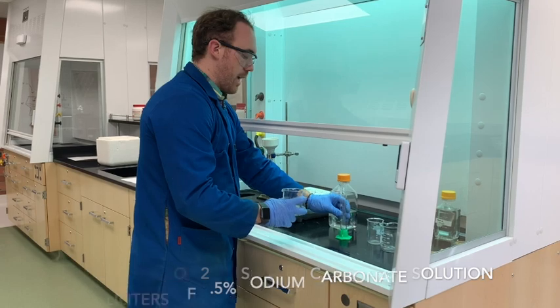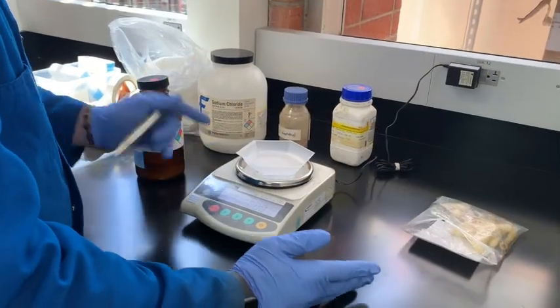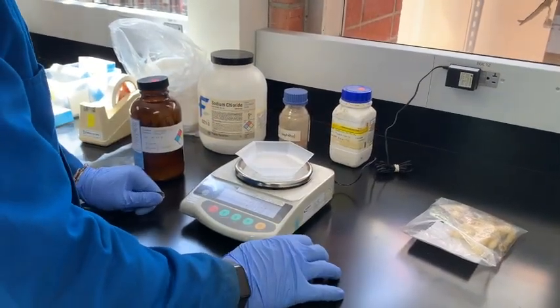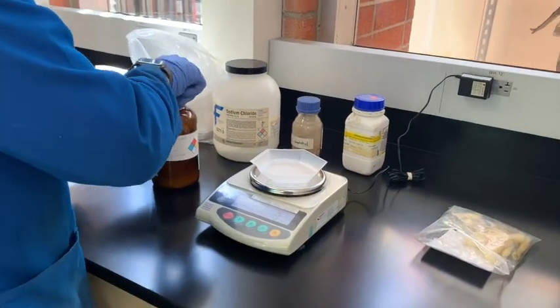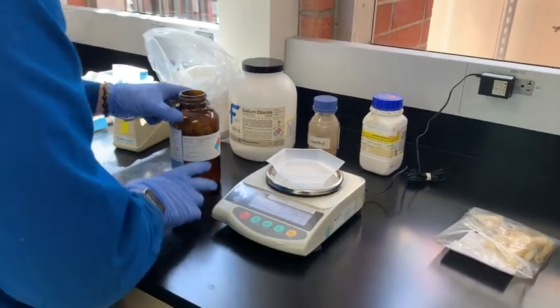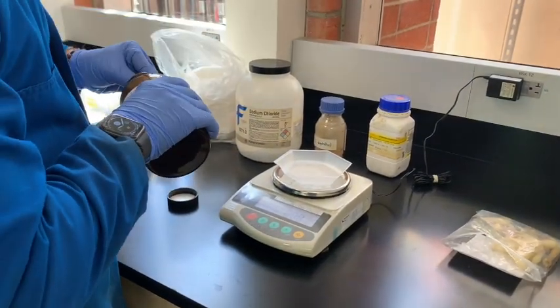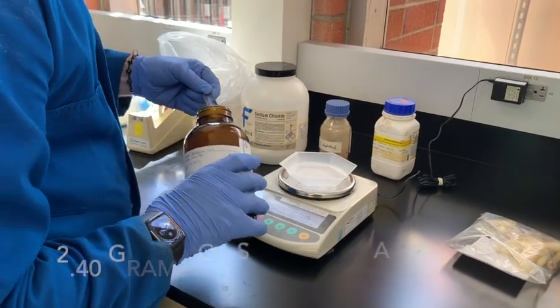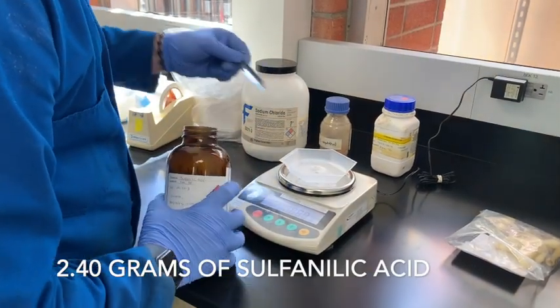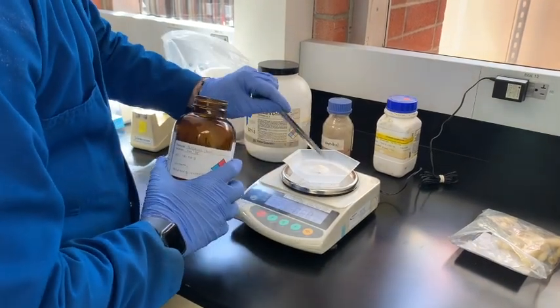And then I'm going to go over to the scale, and I'm going to grab myself a spatula. So the next thing that we're going to add to this beaker is we're going to weigh out about 2.4 grams of the sulfanilic acid. Sulfanilic acid is just an organic compound with an aniline and an SO3H group, a sulfonic acid. So 2.4 grams that we want. This is the macro scale procedure.